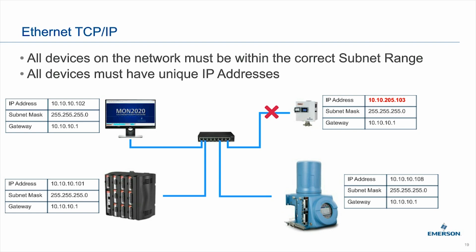They may reverse that change not knowing that another person is connected. So at the moment, we don't allow multiple sessions of Mon 2020 to a GC, simply so that we don't get into a situation where one person is changing something and another person tries to change it back. So although you can have multiple computers all over the network that could talk to the GC with Mon 2020, only one person can be logged on to make changes at a time.